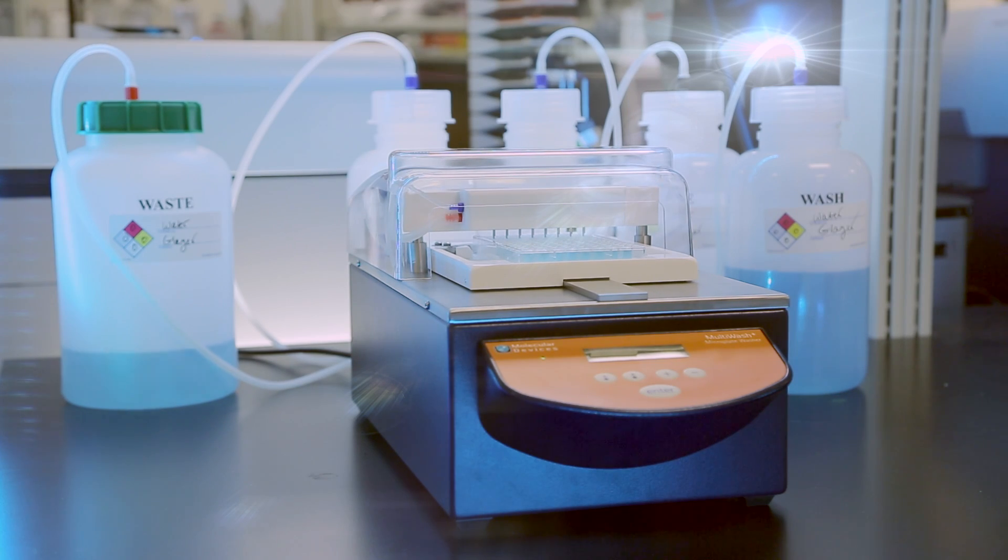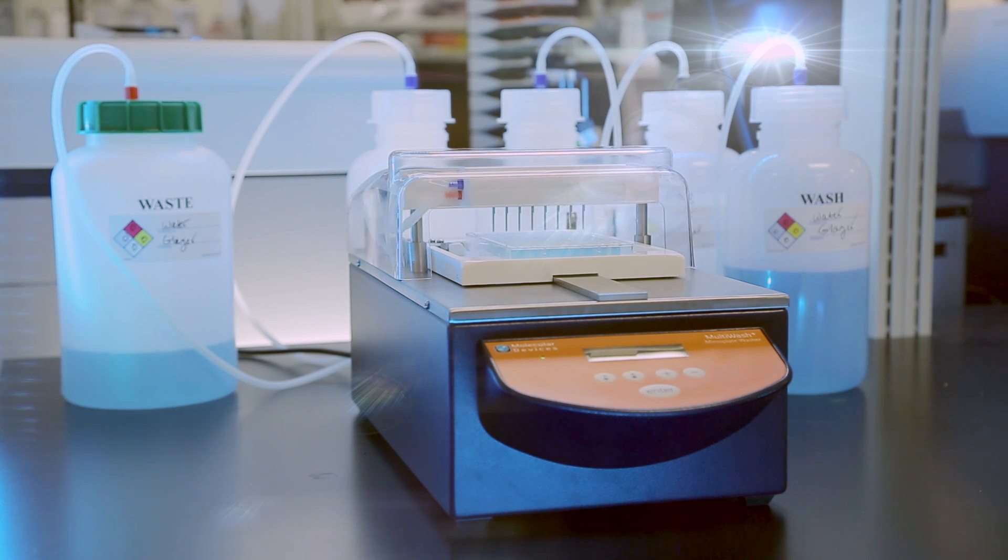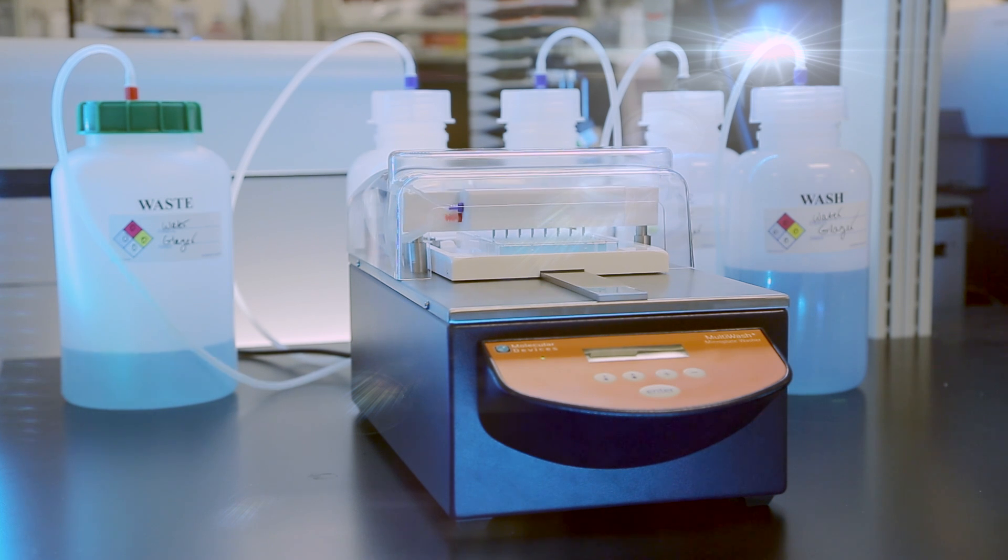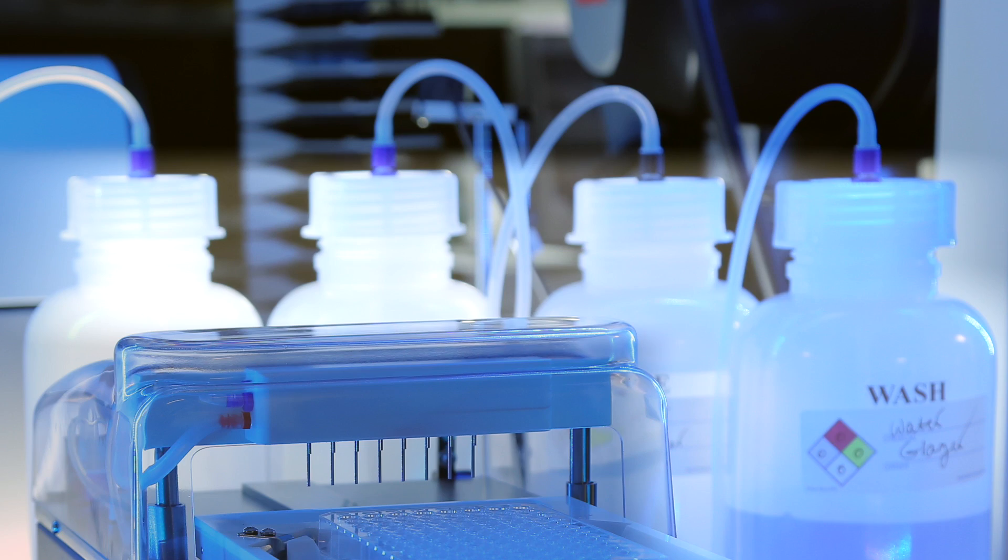After coating, plates can be washed using one of the many pre-installed protocols or can be customized to meet individual experimental needs. A variety of wash-rinse solutions can be included in your protocol because the Multi-Wash Plus comes standard with four wash-rinse bottles out of the box.